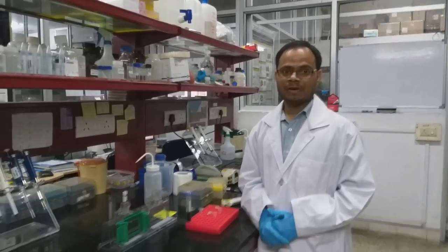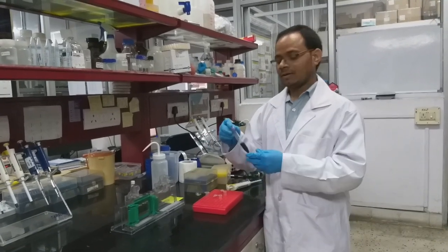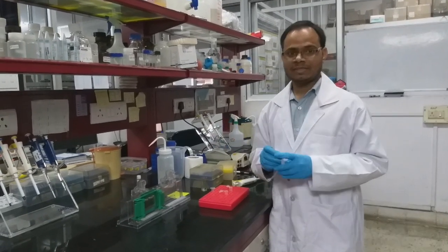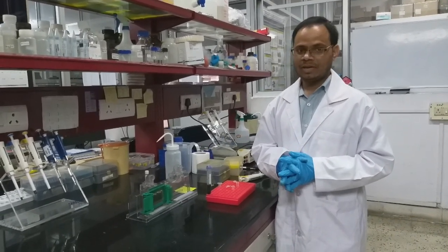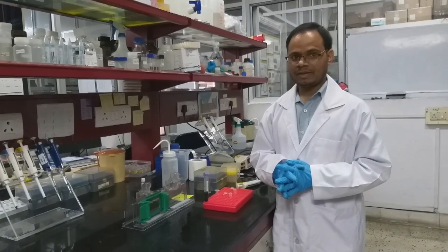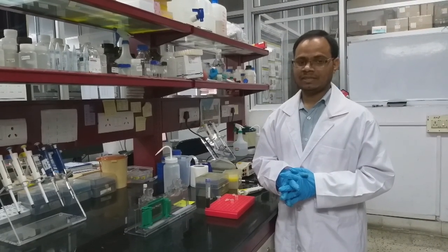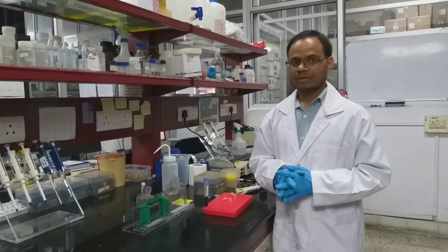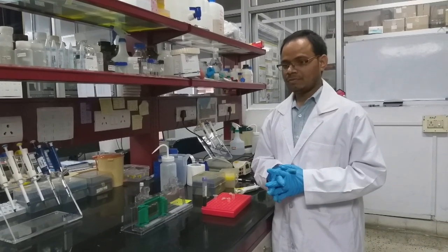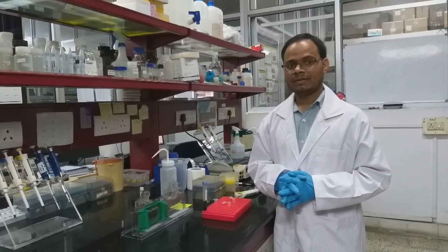While the stacking gel is solidifying, we have to prepare the sample for loading in the SDS-PAGE gel. For that we have to prepare loading dye, 10x or 6x. It mainly contains 250 millimolar Tris pH 6.8, 30% glycerol, 10% SDS and 0.05% bromophenol blue. Here we can add 10 millimolar DTT also as a reducing agent.